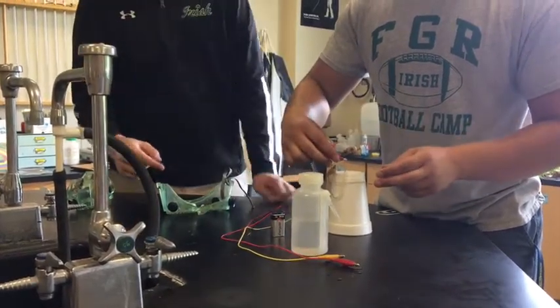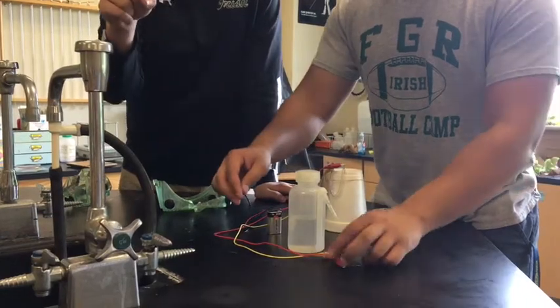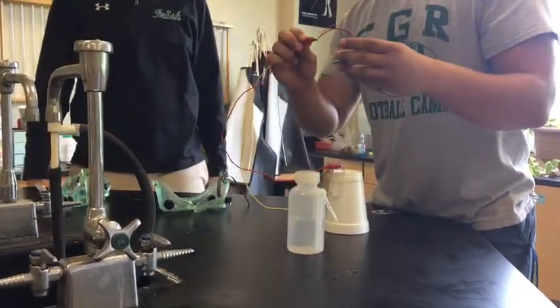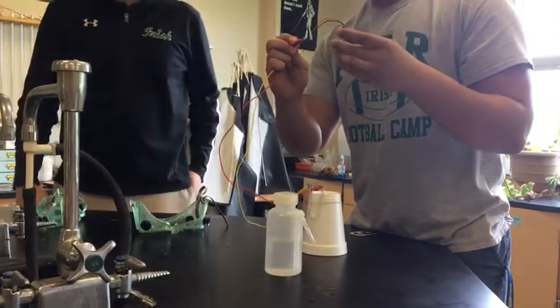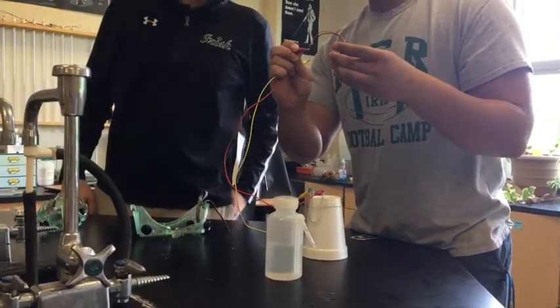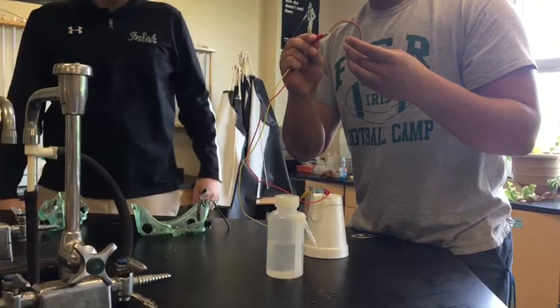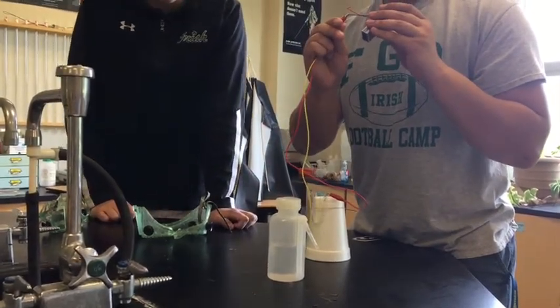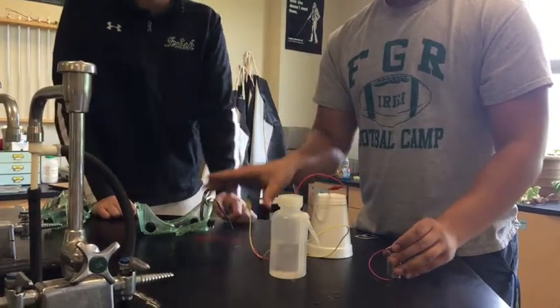Your battery would be on and then you would start to see the reaction. Don't forget universal indicator — that's important, otherwise you wouldn't be able to see the reaction. And you would connect the other side of the wire to the wires of the battery, and make sure not to clamp it to the plastic — you want to clamp it to the metal. If you clamp it to the plastic, it will not work.